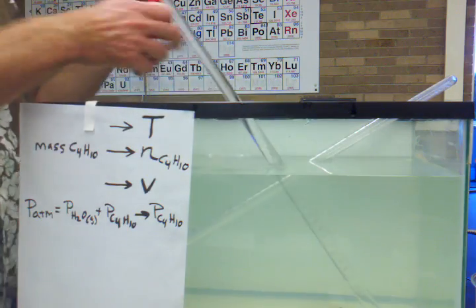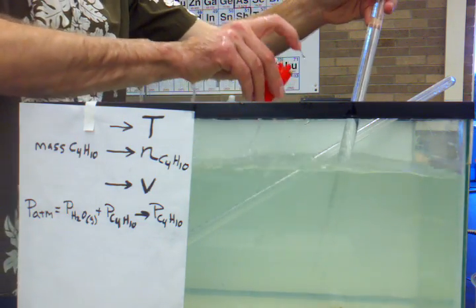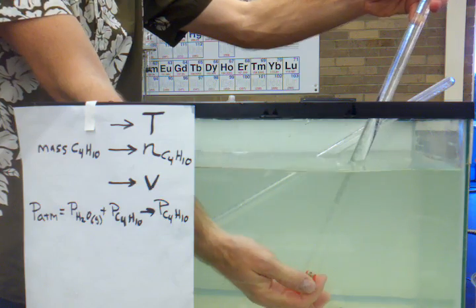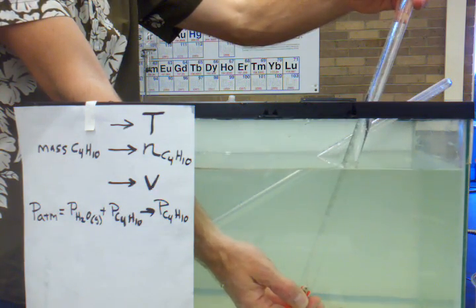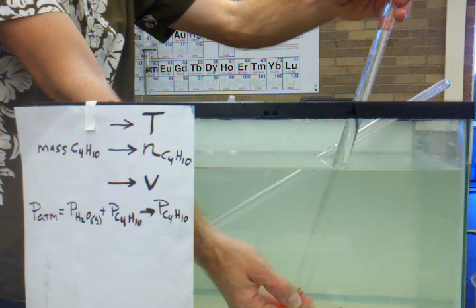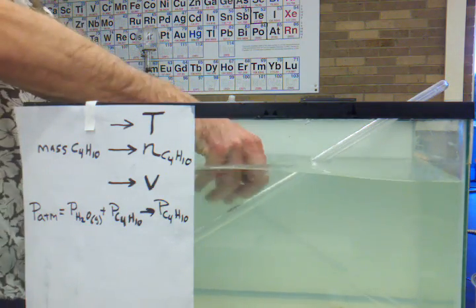We take our eudiometer tube, which is completely full, and put it underneath. The place where the gas comes out is that little brass nozzle there. Put it such that the nozzle is in the tube, and then press our little button. Hopefully you see that the gas is going up and slowly pushing the water out. We're going to let that go for a while. We're going to fill it up until the volume is somewhere greater than 85.